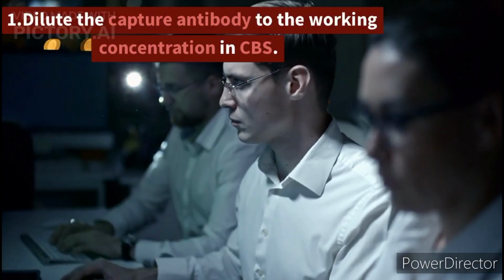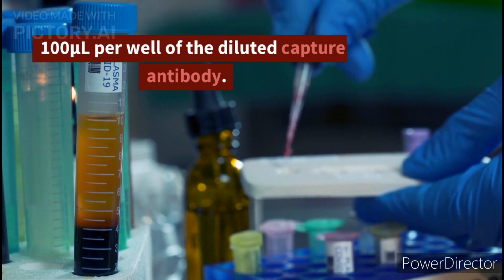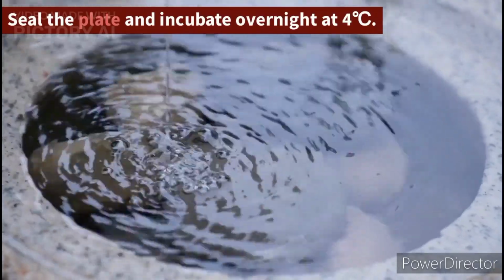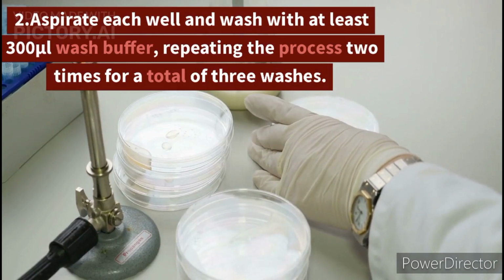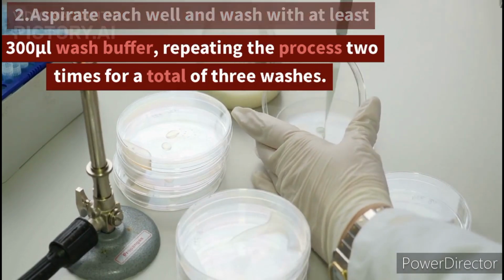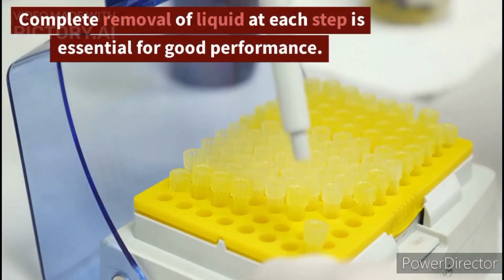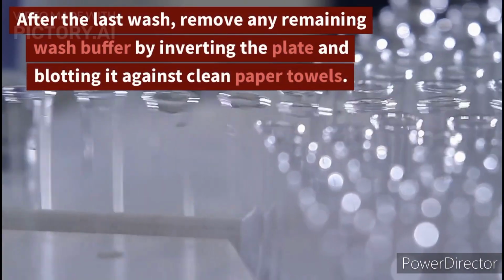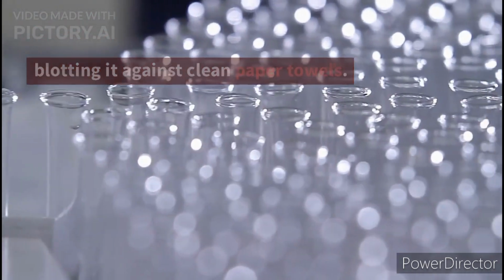1. Dilute the capture antibody to the working concentration in CBS. Immediately coat a 96 well microplate with 100 microliters per well of the diluted capture antibody. Seal the plate and incubate overnight at 4°C. 2. Aspirate each well and wash with at least 300 microliters wash buffer, repeating the process 2 times for a total of 3 washes. Complete removal of liquid at each step is essential for good performance. After the last wash, remove any remaining wash buffer by inverting the plate and blotting it against clean paper towels.